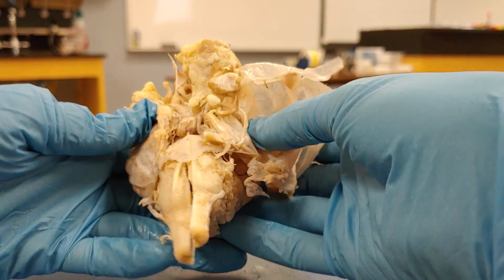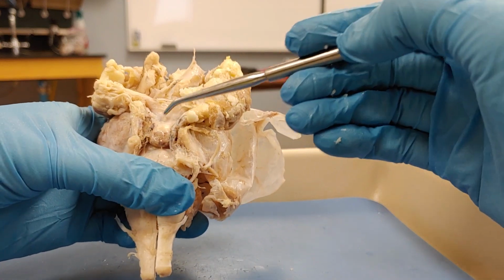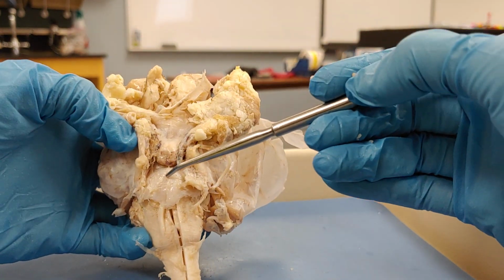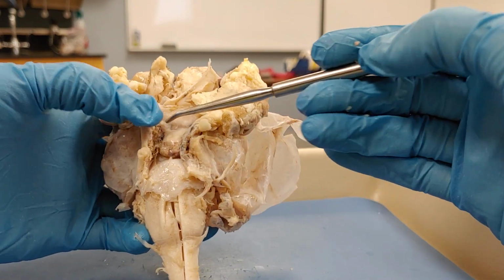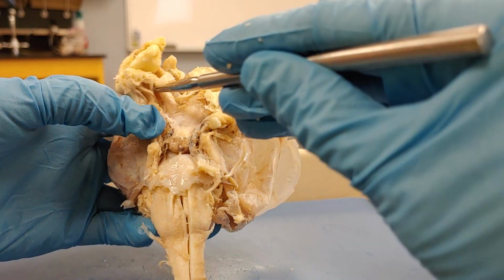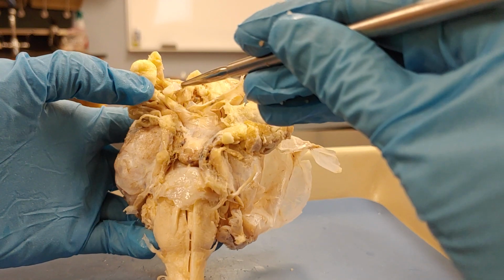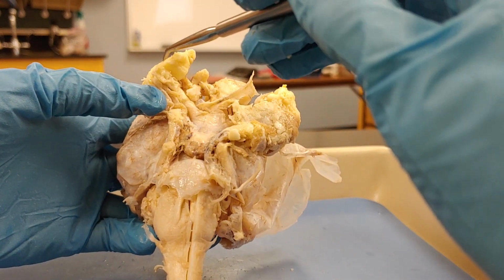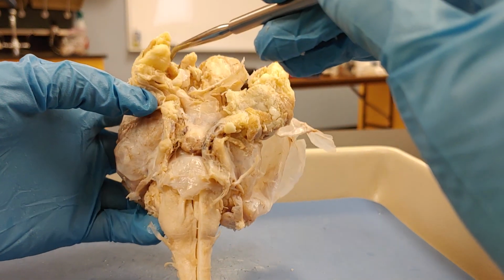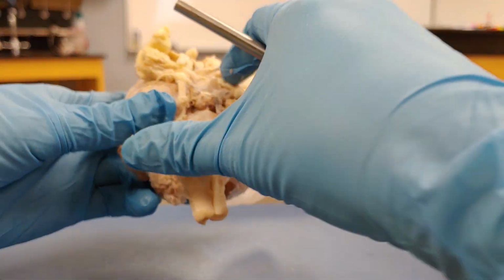On the underside of the brain, we see a few things here. Let me point out to you. Here is the pituitary gland, right? It is sitting above the pons and the medulla. Right above the pituitary, you'll have the optic chiasm, and the optic nerve projects out of either side of the optic chiasm, heading out towards the eyeballs. So the eyeball would be here. This is the fat that's at the back of the eye socket. Okay, so these are some of the structures on the underside.